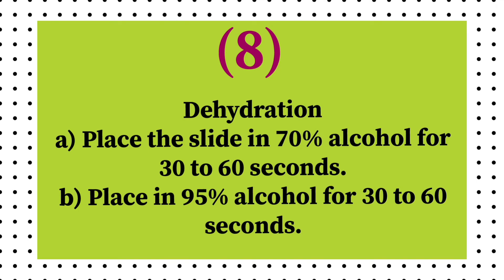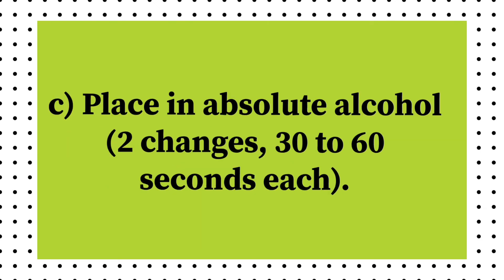For dehydration, place the slide in 70% alcohol for 30 to 60 seconds, then place in 95% alcohol for 30 to 60 seconds. Place in absolute alcohol, 2 changes, for 30 to 60 seconds each.